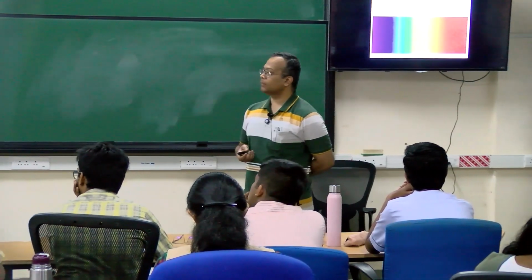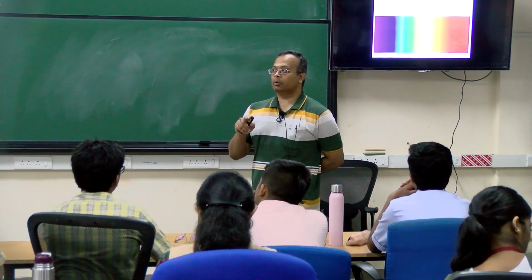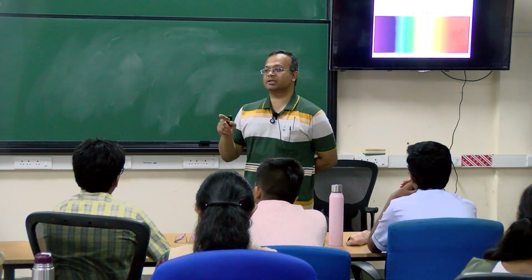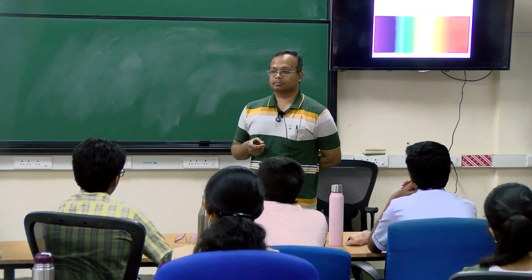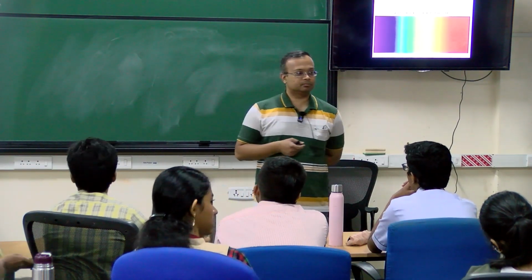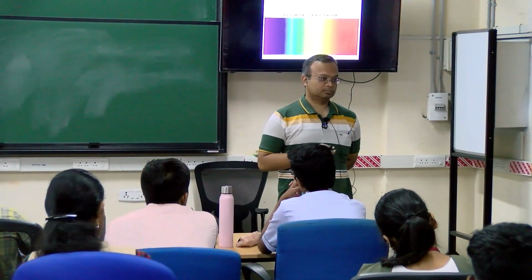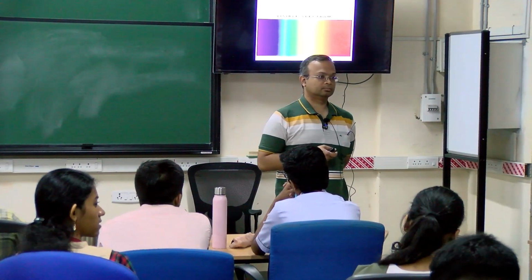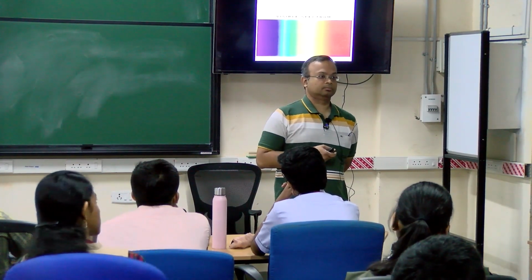Okay. Now, before we go into fluorescence plus microscopy, I want to tell you why do we need fluorescence and microscopy? Why not only microscopy? Better identify the sample. Fluorescence, and it's actually emitting light. Better to resolve the image and be able to see more clearly than if it wasn't fluorescent.